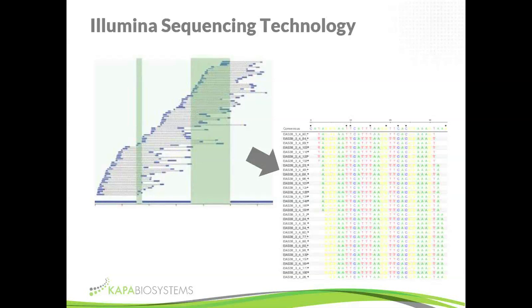There are lots of sequencing metrics and QC metrics and terminologies that are important, but I just want to highlight three for the purpose of this series. The first is sequencing read length, which determines the length of these overlapping fragments. Sequencing read length is determined by the sequencing chemistry you use, and also the instrument you use.